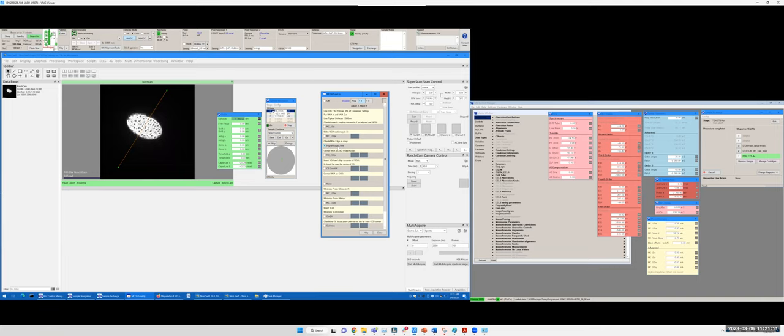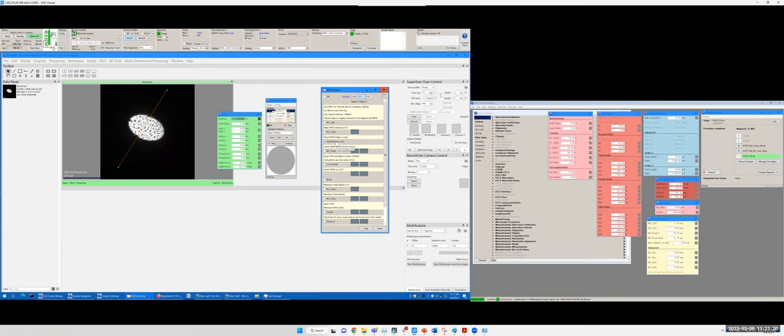Yeah, so this is the voltage. It's an alignment that is not linked here. It just shows you the effect. So you can ignore that because it won't give you options for you to update the instrument. So you jump to the next one. Okay, so you can see when you wobble this 21QX, you can see the beam is moving around.